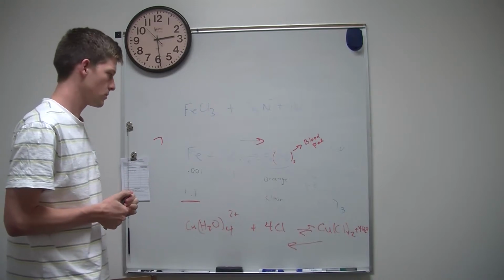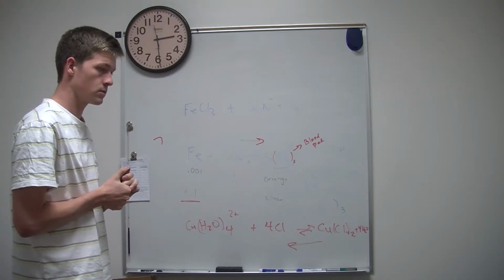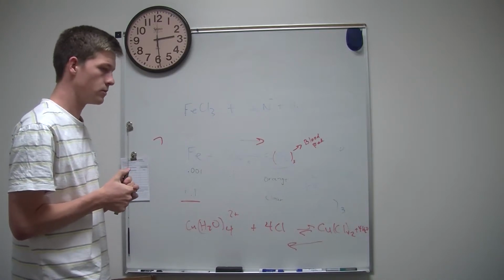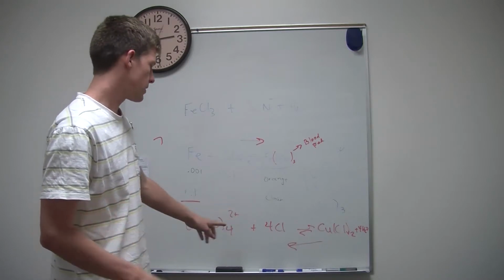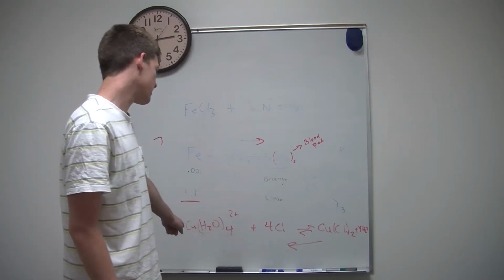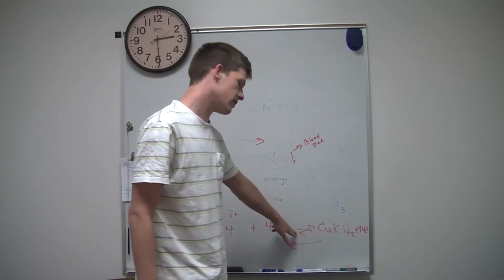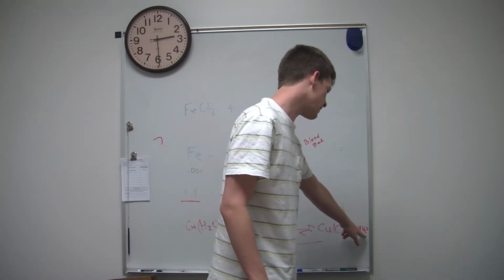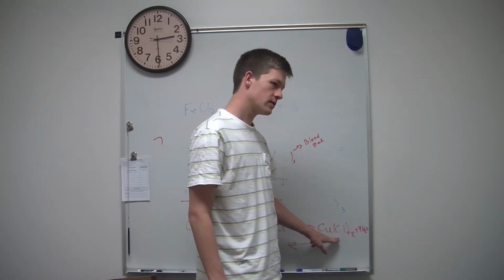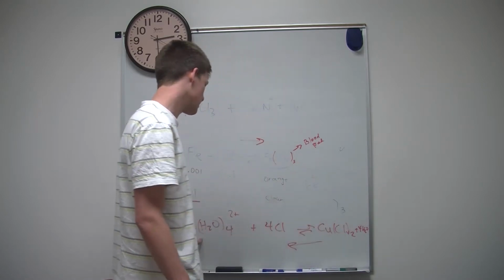So is that because we see water over here? So it doesn't have to do with the side with more moles? Because, okay, what I'm looking at is this is at equilibrium, right? If we give this water to mix with, it's going to mix and go here. Right.